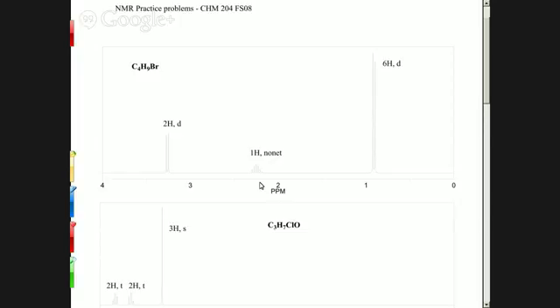Right? I mean, likely a group of 2 hydrogens that are the same is going to be a CH2. It could be 2 CHs that just happen to be exactly in the right position, but likely it's going to be a CH2. So you have one piece that's a CH2 that has 2 connections.